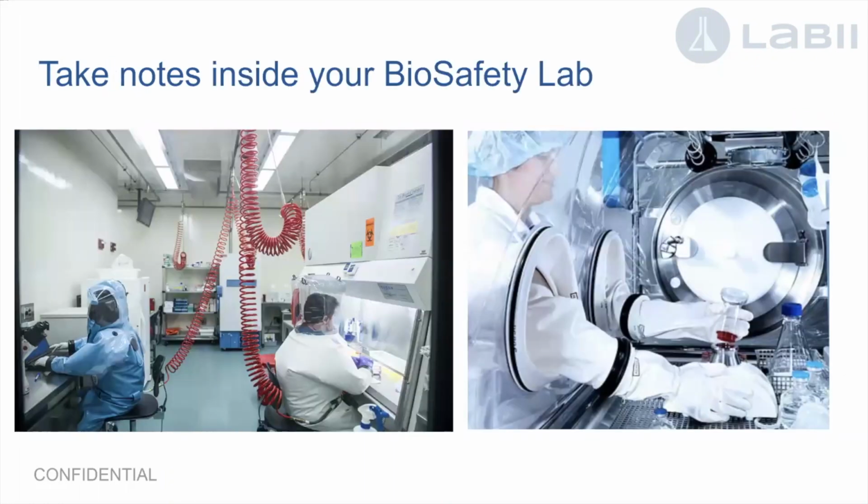Currently, during the pandemic, the ELN has become more important, and we're trying to help all different kinds of biosafety labs. Using a piece of paper there definitely doesn't work. It's so much better if they have the ELN inside this kind of biosafety lab, document inside, and then the results can be shared with outside labs directly.